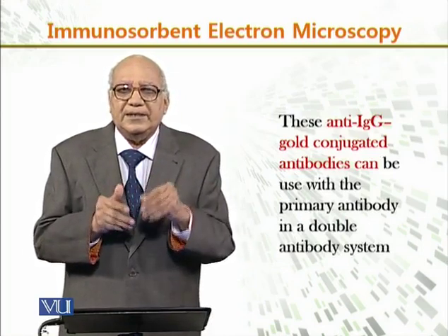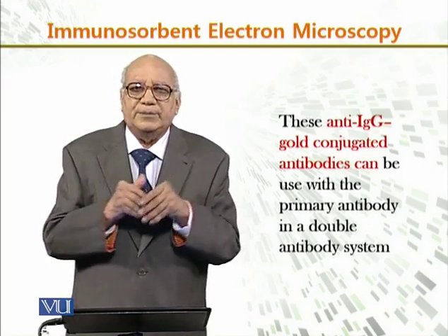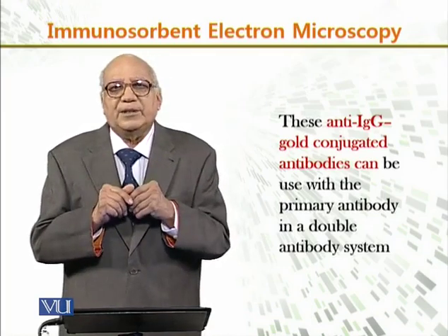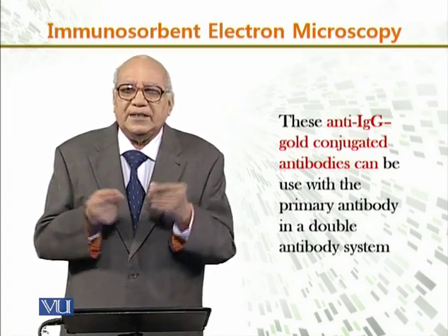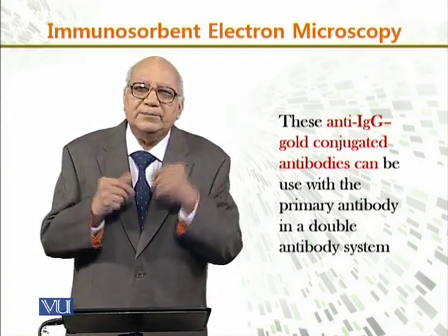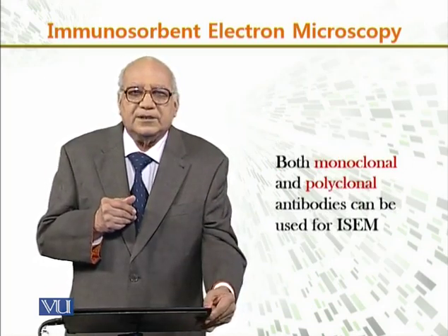Now, these anti-IgG gold-conjugated antibodies can be used with the primary antibody in a double antibody system. So we can use a double antibody system, and these IgG gold-conjugated particles can also be used with that primary antibody in that system.